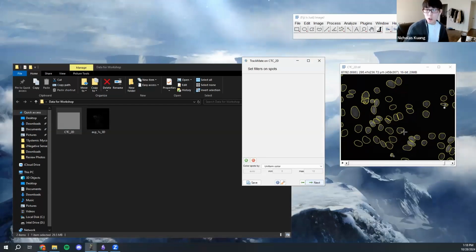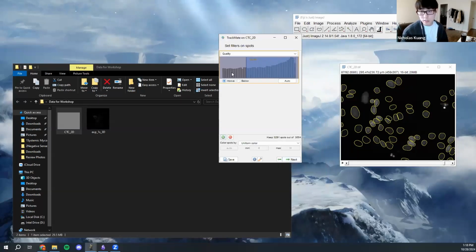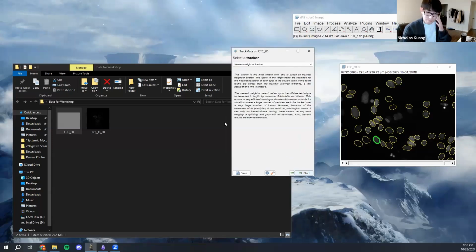Yeah, and of course, we took all the detections and we didn't eliminate any. And this is where we recommend TrackMate, because it has that extra filtering, and you can individually delete the ones that are outrageous, which is the benefit of integrating into TrackMate. And then beyond this is actually the TrackMate features again.